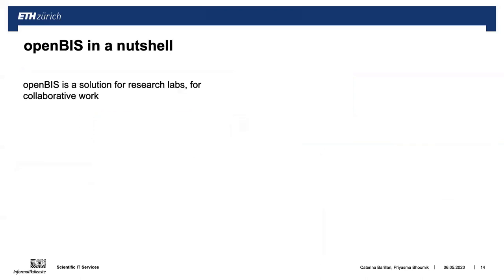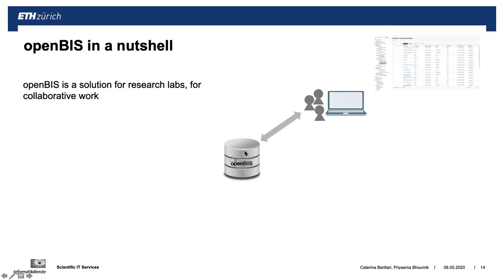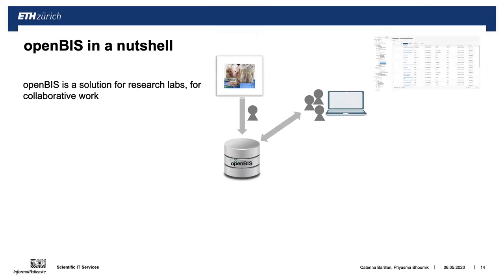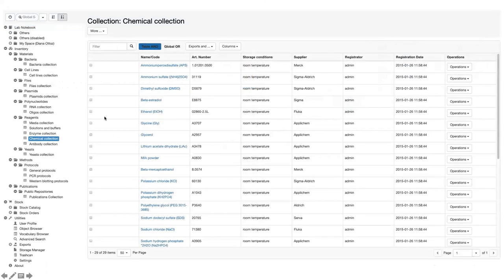In a nutshell, OpenBIS is a solution for a research lab for collaborative work. It's a client-server application: you have a database installed on a server and users access OpenBIS via a web interface. It can be used to store information about materials and samples — here we see the default life science version, but these can be customized to your needs. Here you see we have an inventory with materials and different collections. If you want to add additional collections that don't exist, this is absolutely possible. Here I have an example of a chemical collection — a table where I see all my chemicals, which I can filter, export, import, and so on.